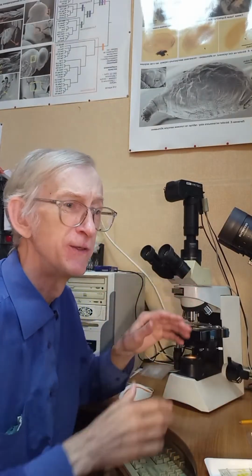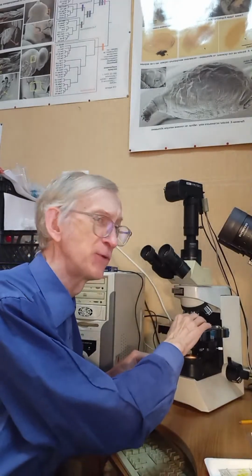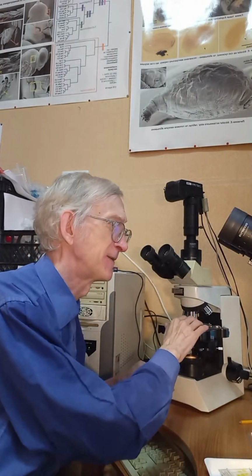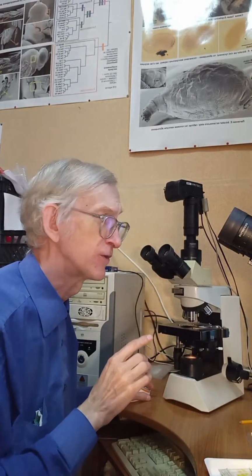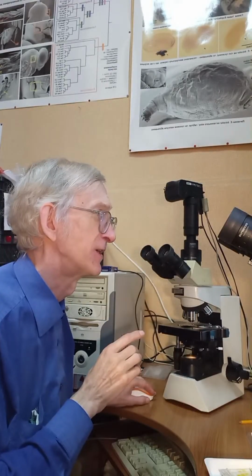I will try to show you it in a special folder. I already took some photographs. Let's go forward to come inside the computer and watch some details of male genitalia. For that, I put here my slide for taking photos, and I already did some photos preliminarily.